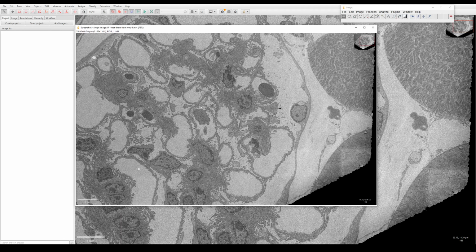Now you may want to do something different, which is to take a higher resolution view of some particular subset of the sample and then add a scale bar that's not this transparent one. Maybe you don't like that scale bar, you want to add something different. So how do you do that? The way you do that is you create a rectangle in the particular region that you want to get a snapshot of. Let's say it's going to be this region. And then you click here and you say send region to ImageJ.